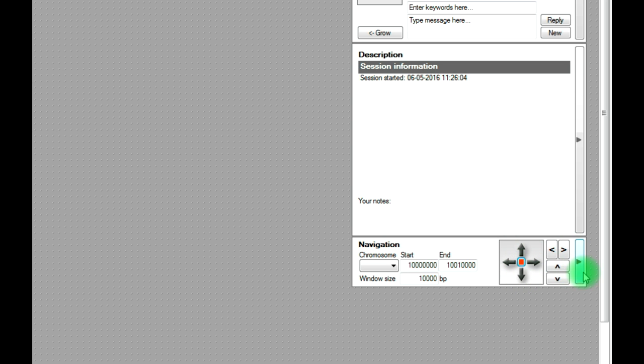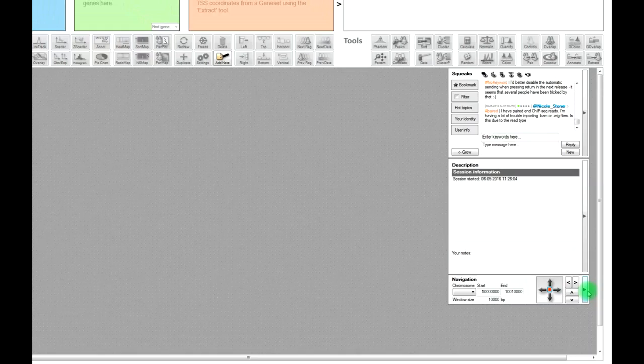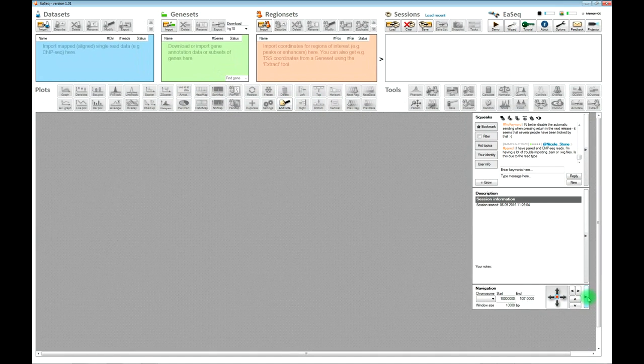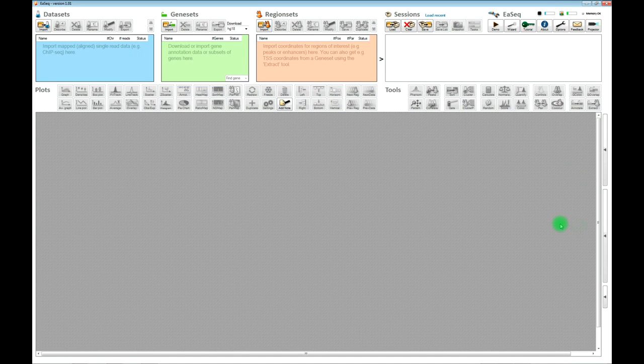The final panel here is the navigation panel, where if you use EASEQ as a genome browser you can type in coordinates or zoom in and zoom out. If you think the panels take up too much space, then you can just minimize them so they are not interfering with your work.